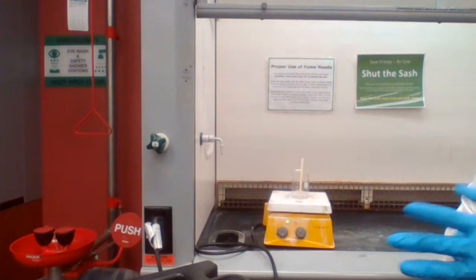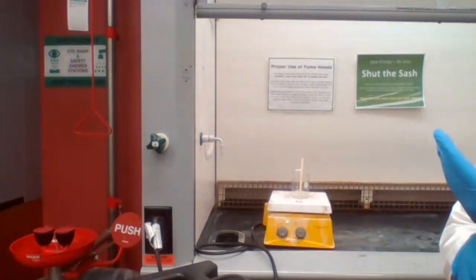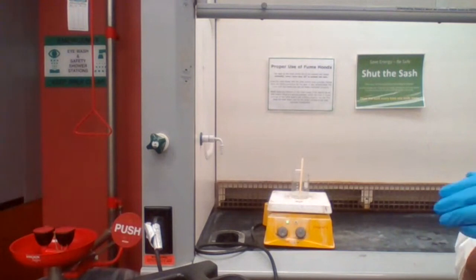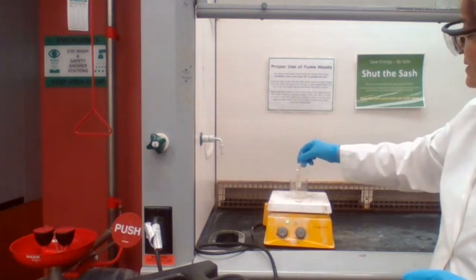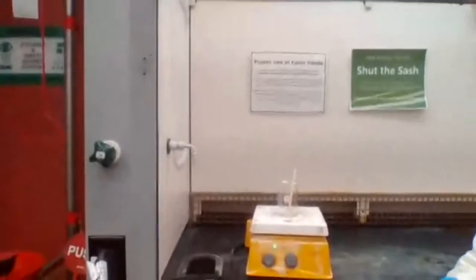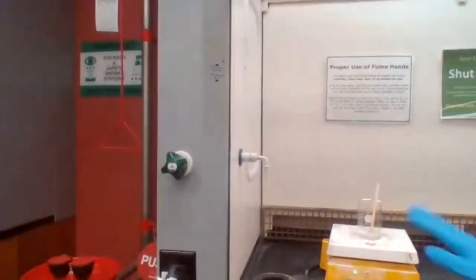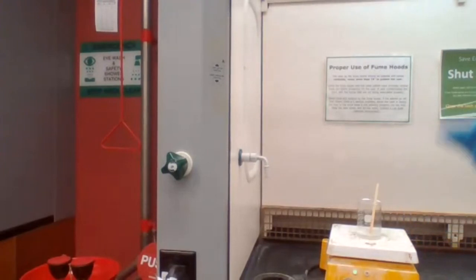Also, if you were the one working in the lab, you would be cleaning up your workstation to get rid of everything that's not necessary anymore. Say this is boiling aggressively. I can probably bring it closer for you to see it. When it stops boiling initially, that means all the ether is gone.